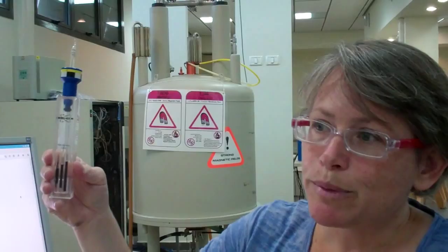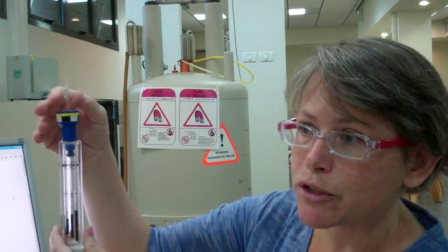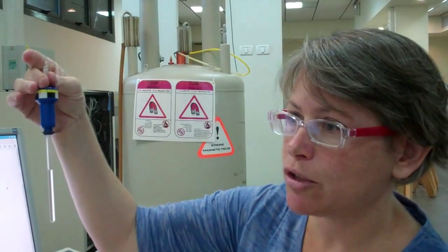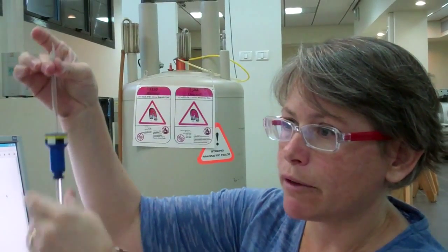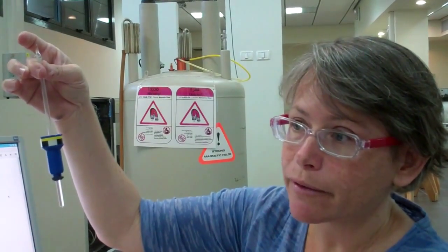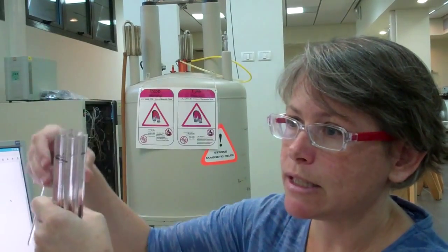If the glass sample tube sits too low, it may hit the probe and break. The spinner certainly won't sit in the right place for sample spinning. If it's placed too high, the solution might not reach the detector, and then we're doing an NMR experiment on air. So you do want to make sure that the tube is correctly placed into the spinner.